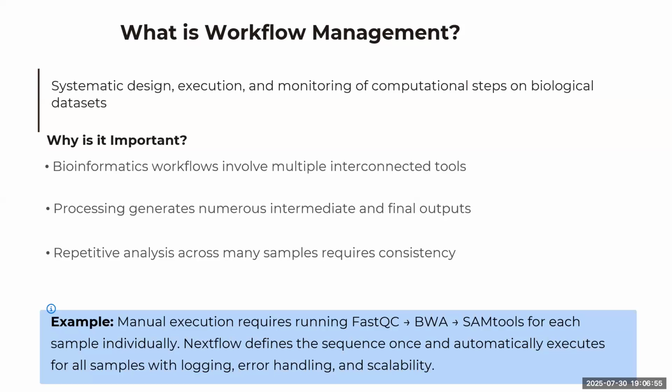It helps us to clearly define all the steps that we want in the analysis, and it is also able to handle the dependencies between the steps. Like with alignment, the quality control must be finished before it. That is how it moves to the next step.